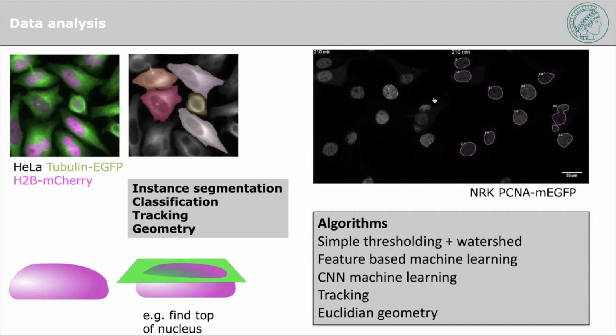In fact, some of these algorithms may take a lot of training data, and may be an overkill for certain problems. So you may do thresholding and a watershed, and you solve the problem. And this is much faster. You don't need to create training data sets. You will still have errors, but comparable to the CNN errors.